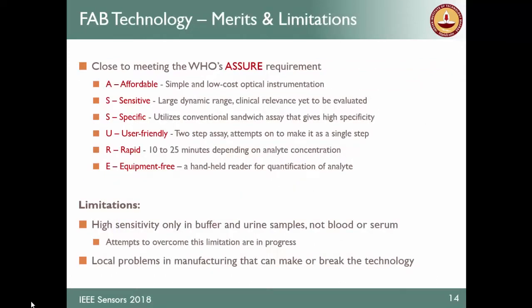We see that our sensors qualify for the WHO criteria. The only problem, unlike LFA, is one thing we have to work on. We haven't gotten rid of that yet.